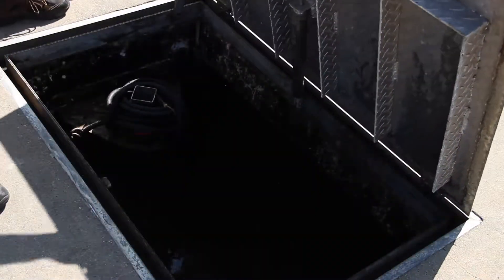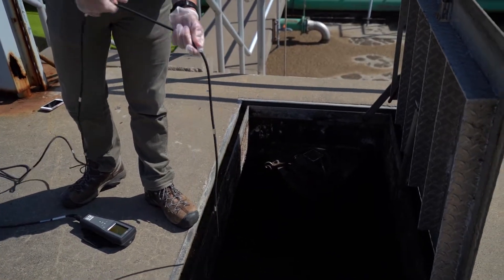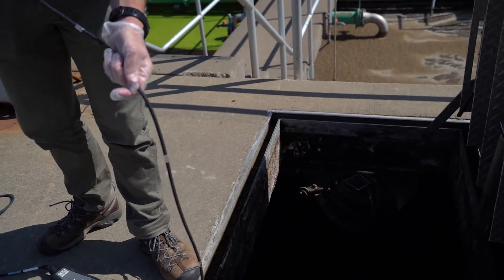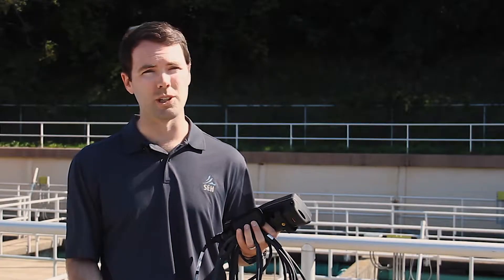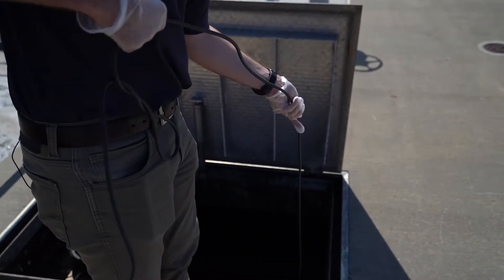We'll take this cover off and then lower it down into the water. These tape marks are to give us an idea of how deep we are, so we'll check it out at multiple depths. These tanks are about 20 feet deep, so we'd probably go multiple increments towards the top and then a few towards the bottom of the tank.